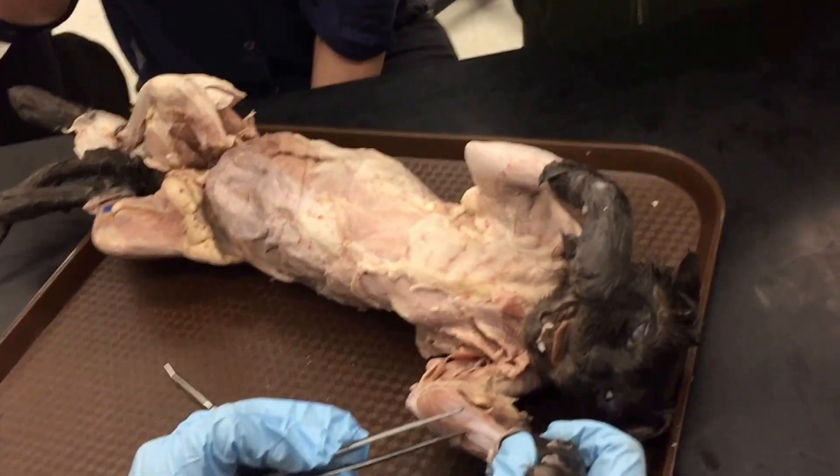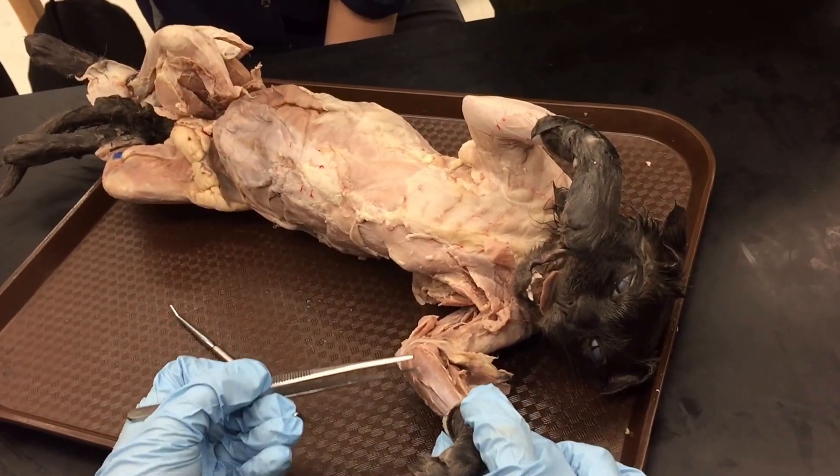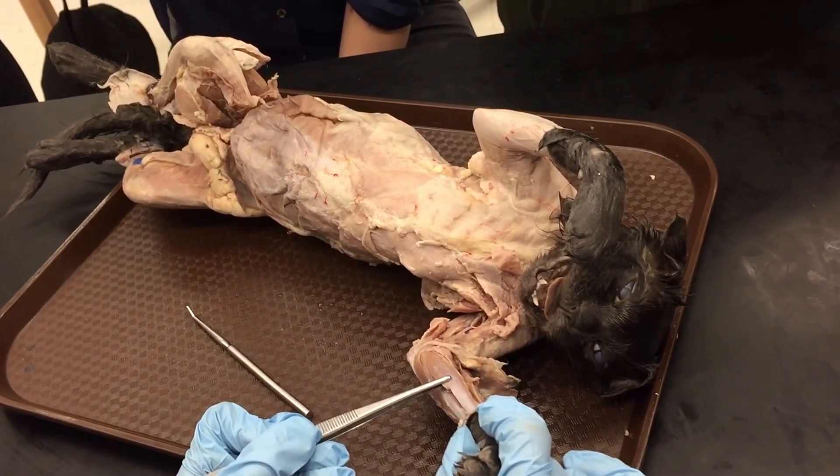The easiest one to find to start is the biggest, widest muscle on the flexor side — this is the palmaris longus. That's by far the easiest one to pick out on the flexor side.